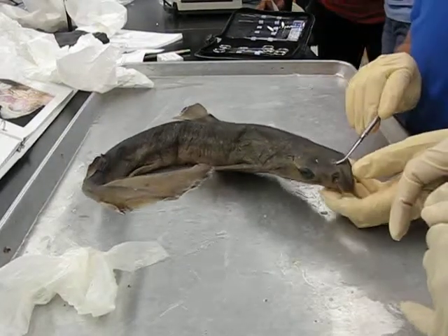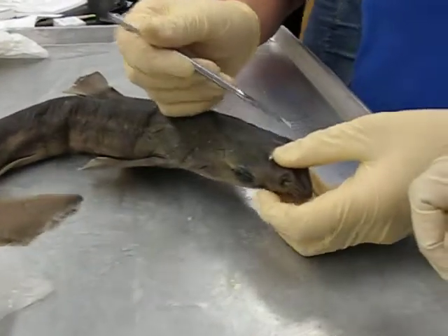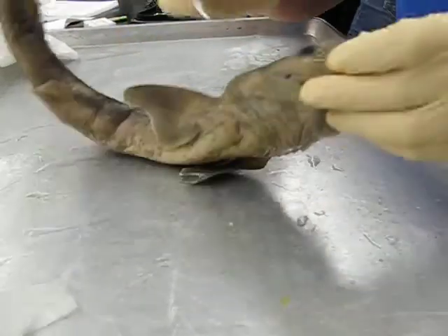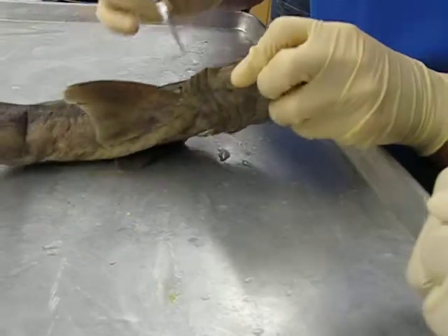So here's the rostrum, the eyes, this is the spiracle, under here is the nostril, the mouth, and we have the gills over here.